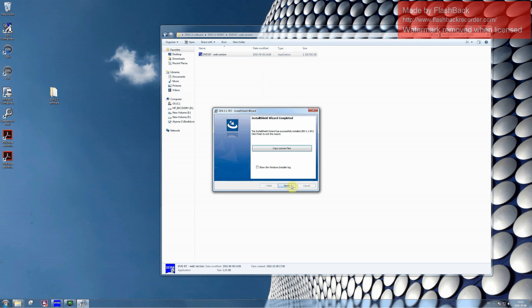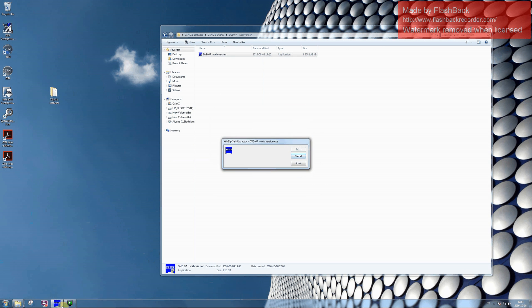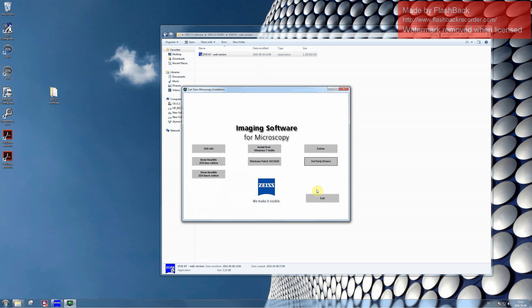And then click on Finish. Proceed to the Installation menu and click on the button Exit.